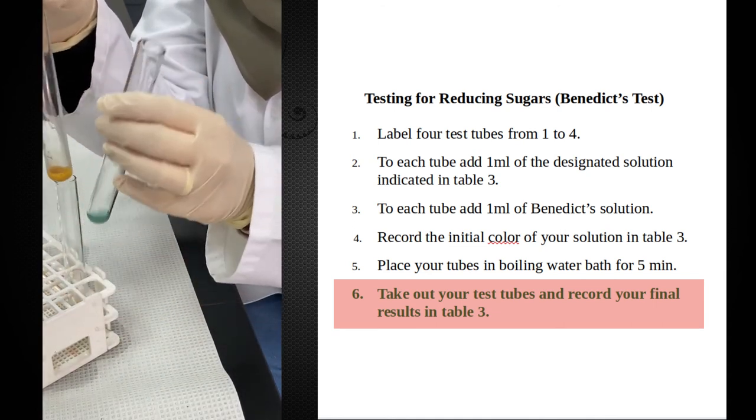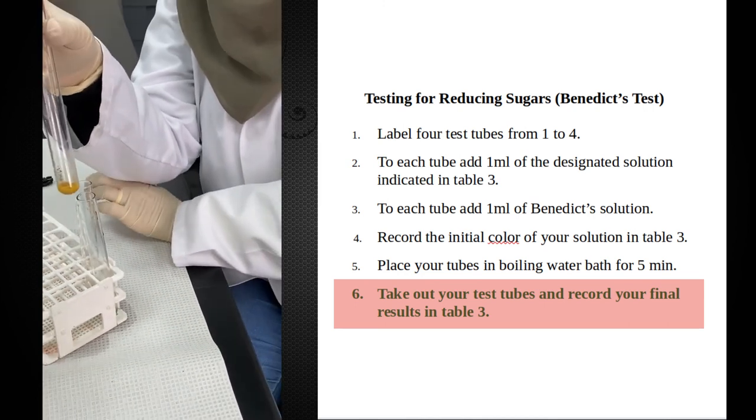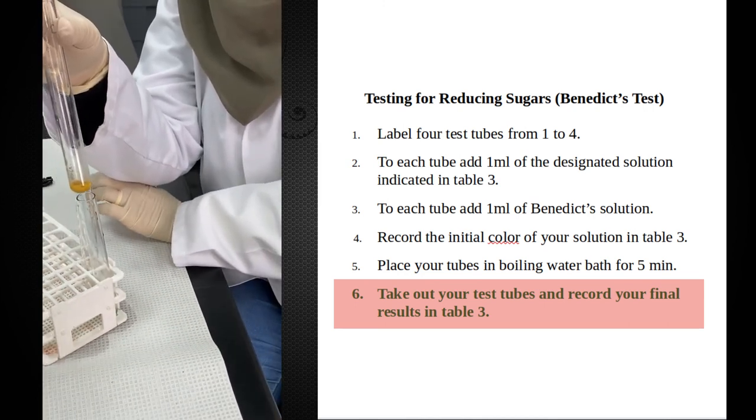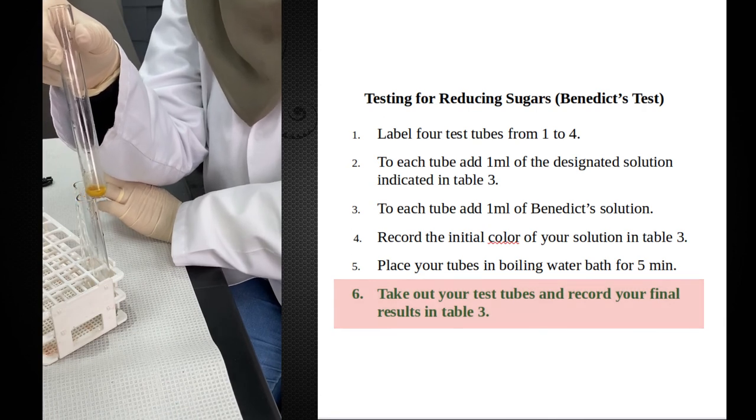There is a changing color, it's definitely not blue. We see this dark orange color as an indicator of the presence of reducing sugar in the milk.